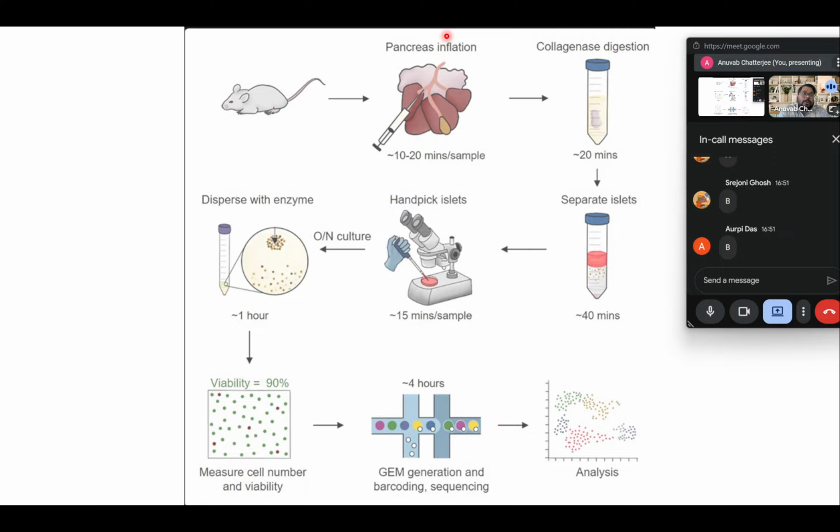Isolation of DNA or RNA cannot happen directly from the tissue. The techniques that we use are supposed to be used on cells because tissues are very resistant to all of these different enzymes or different conditions that you use to isolate DNA or RNA.